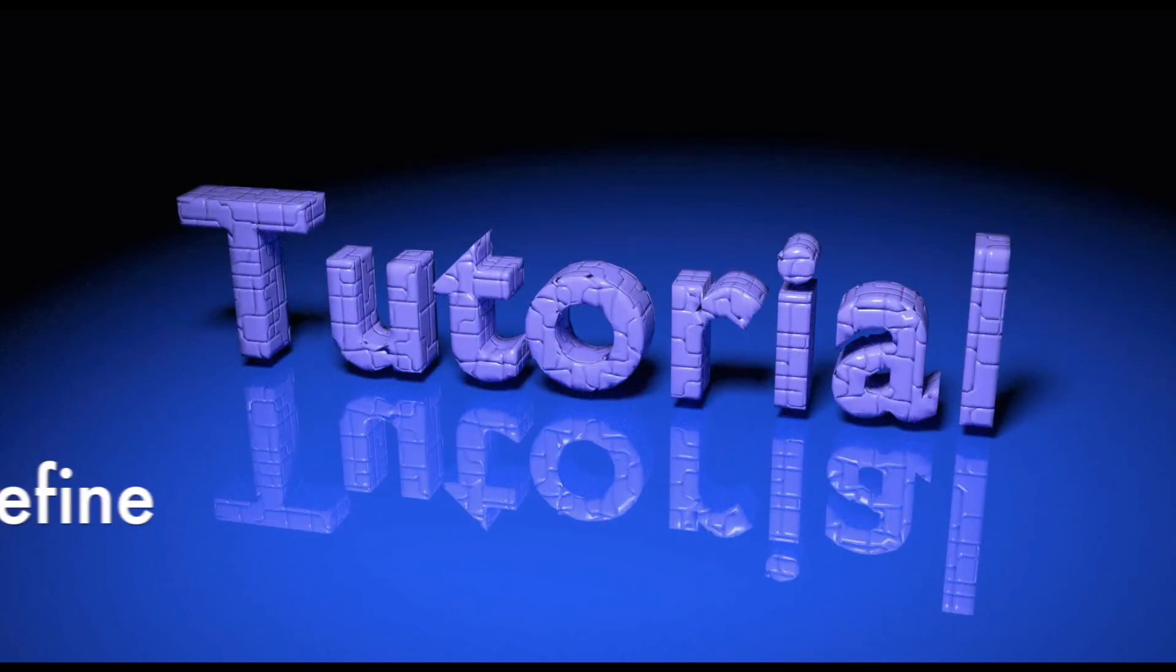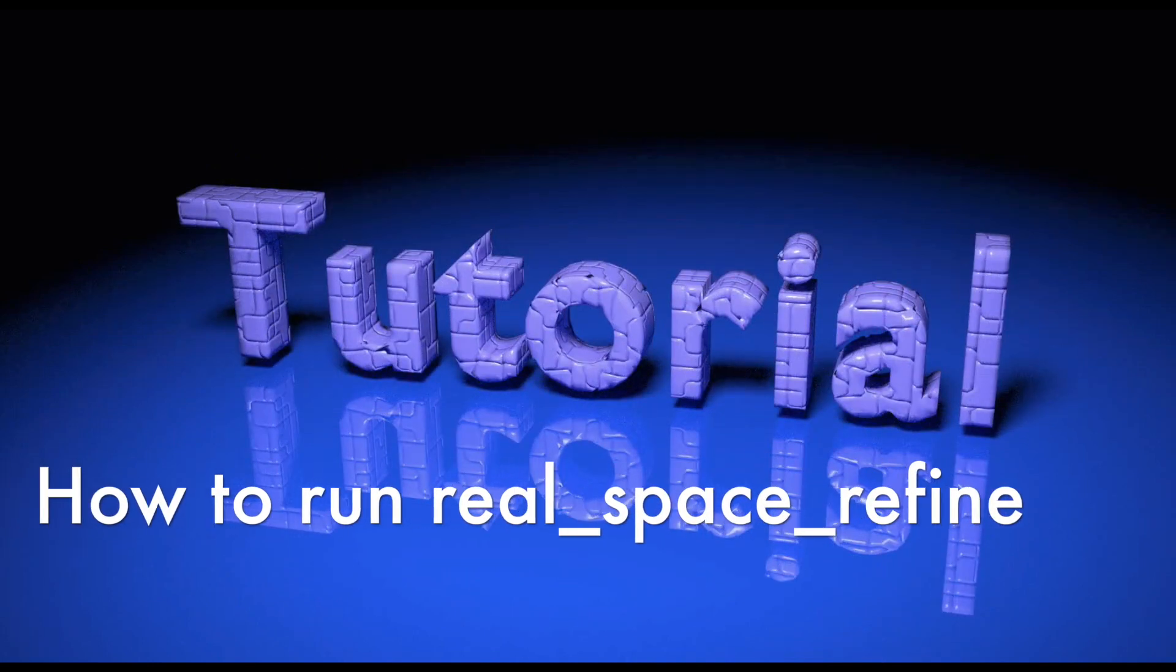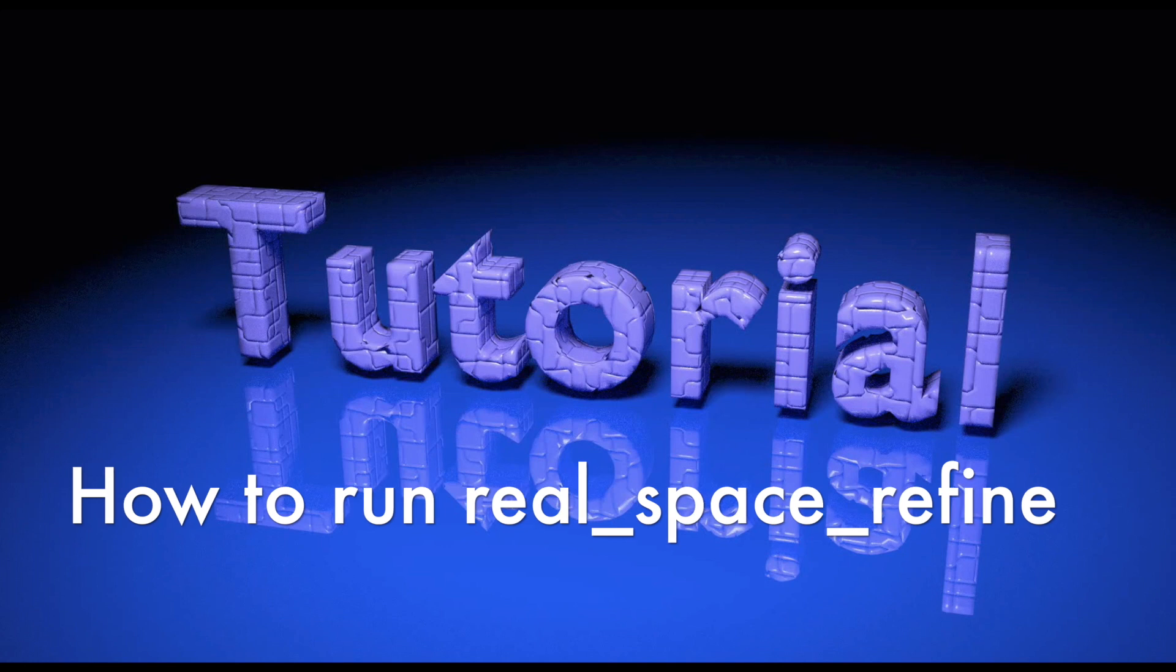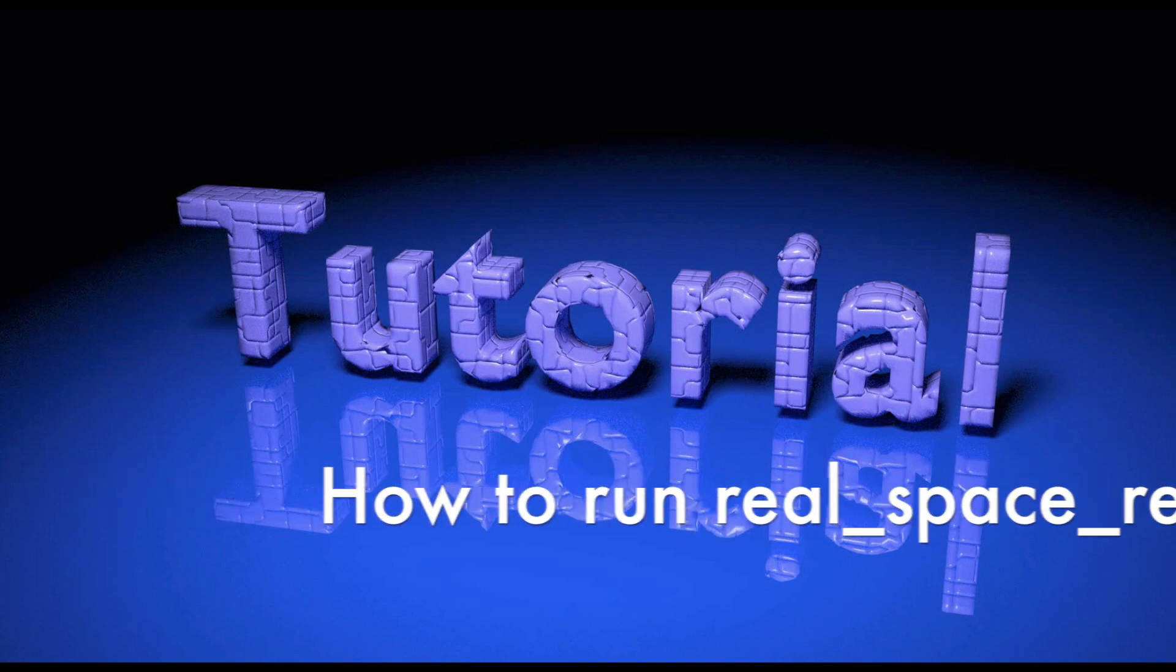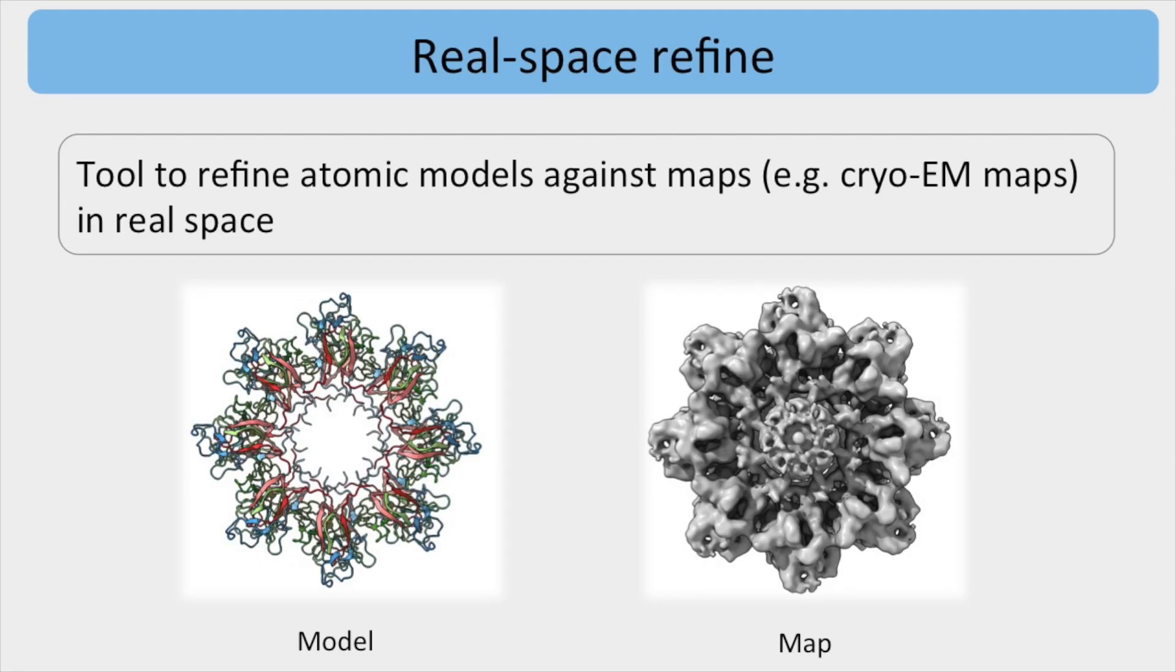Hi everyone! This tutorial explains how to run Phoenix RealSpace Refine using the Phoenix GUI.